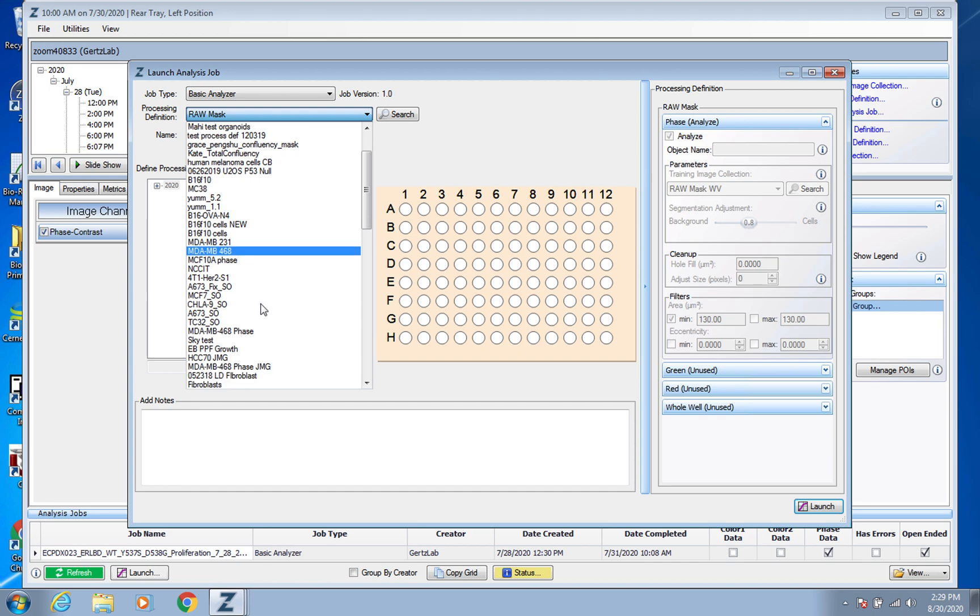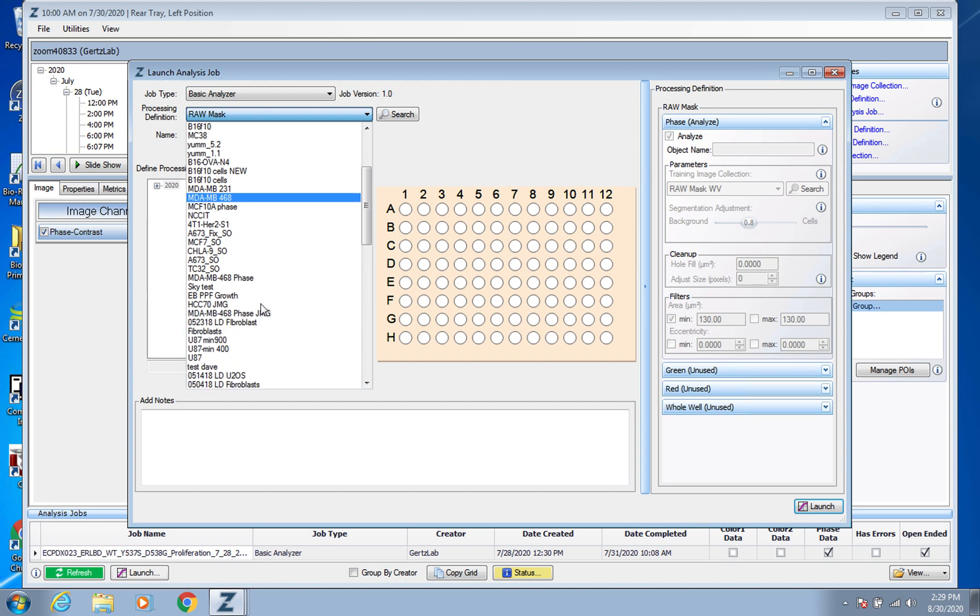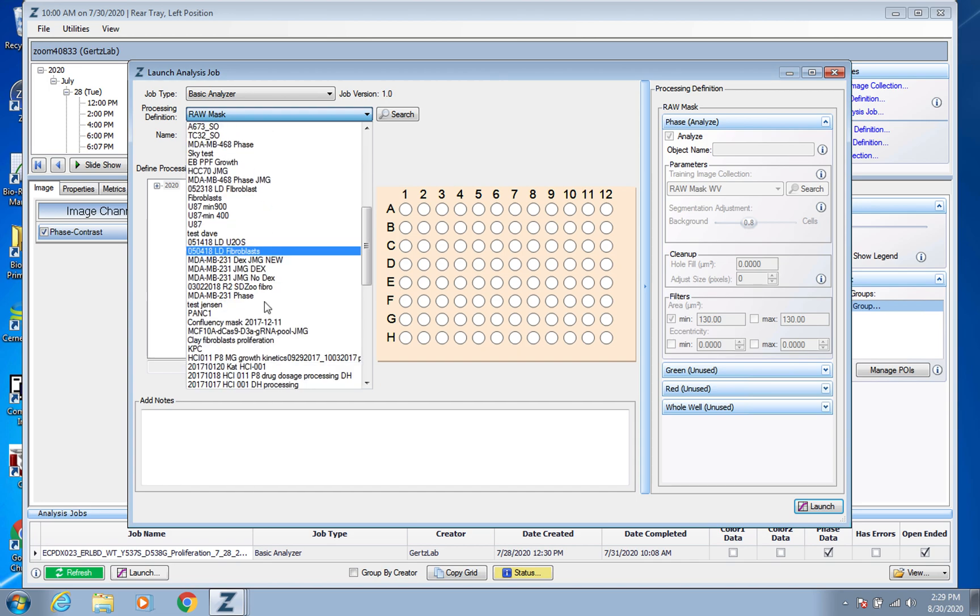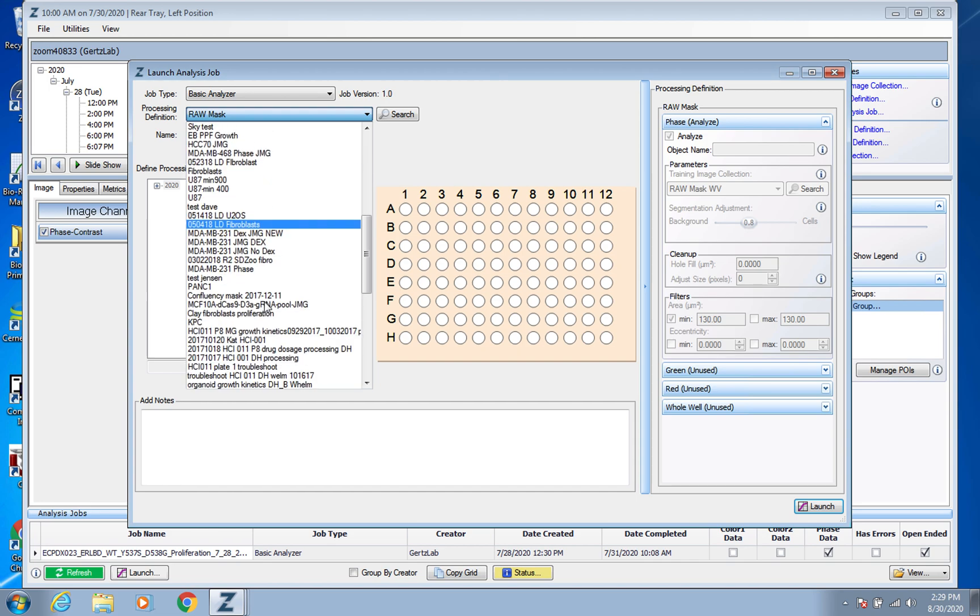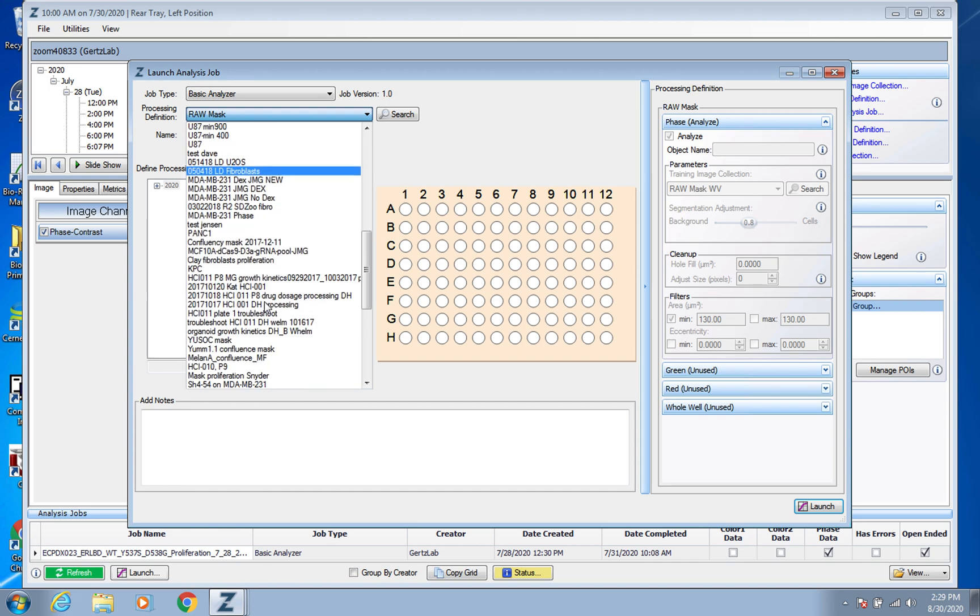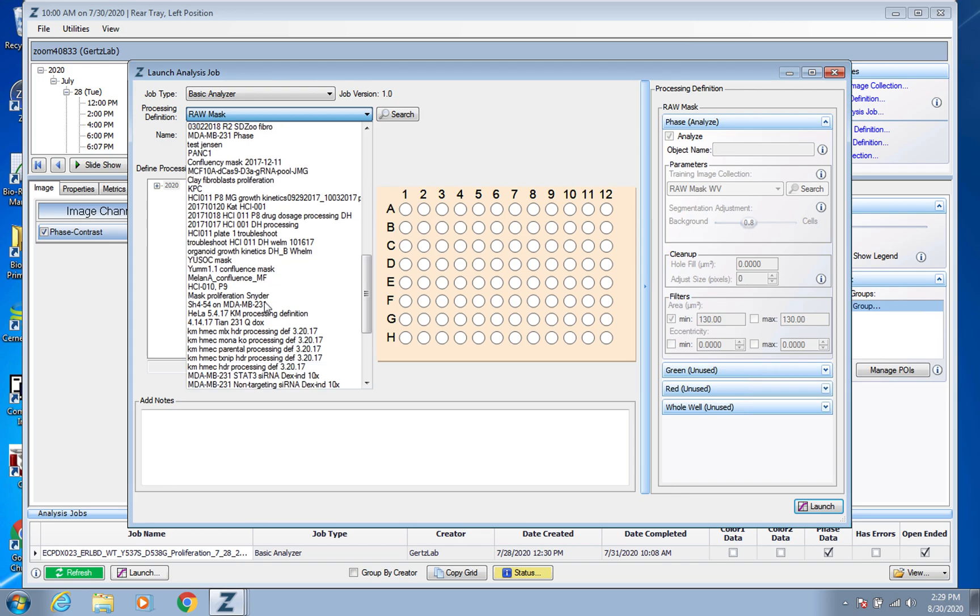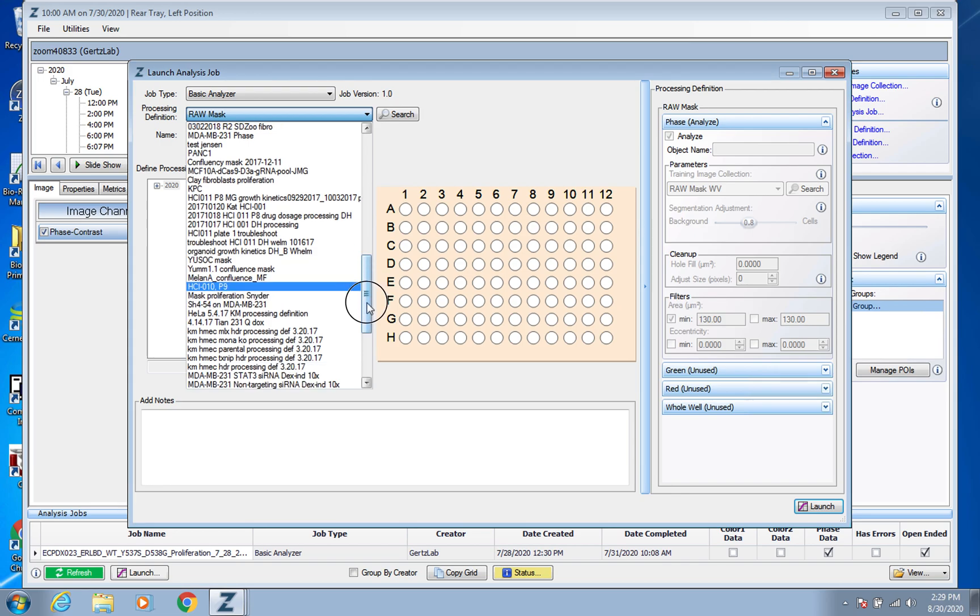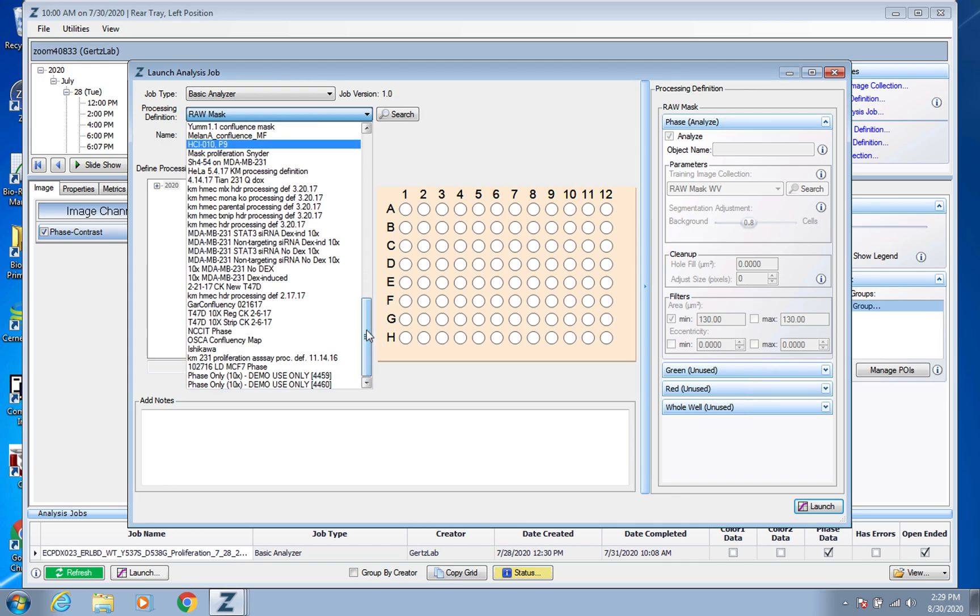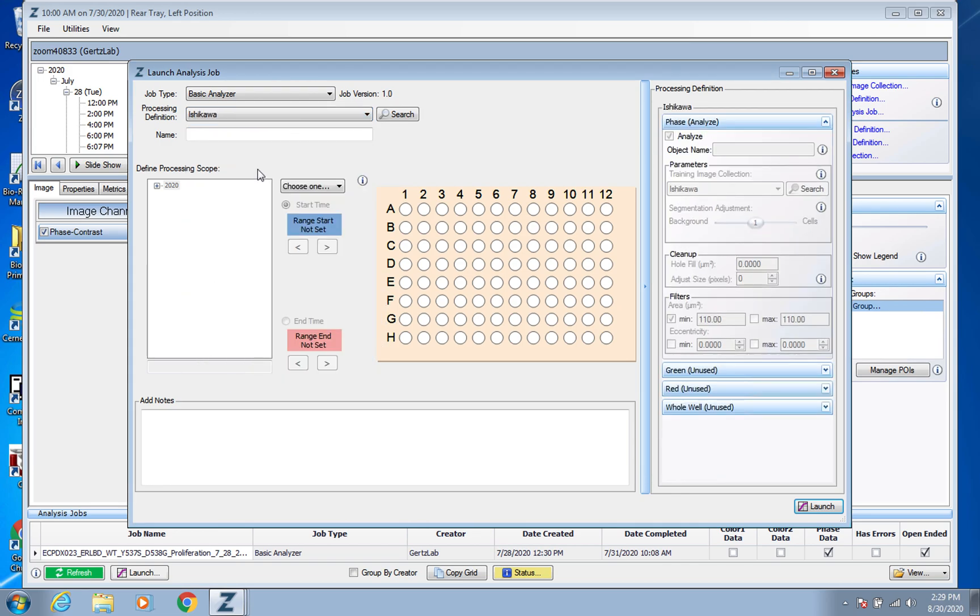But this MCF7 if it has ACR those are my initials and I probably made that, and then there's also one that's just called Ishikawa. Most of my cells are normally endometrial cancer cells so that's what I use.